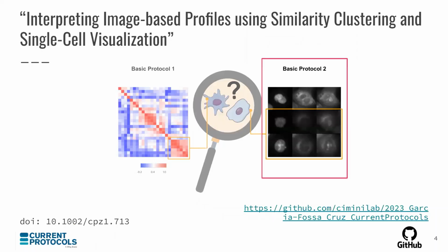In this presentation and demonstration, I'm going to show you how to use our notebooks with real data. It's important to note that in the paper, we have an example data set available on GitHub, which you can follow through the instructions of the paper. But here, I'm going to show you a real-world example using my own data.